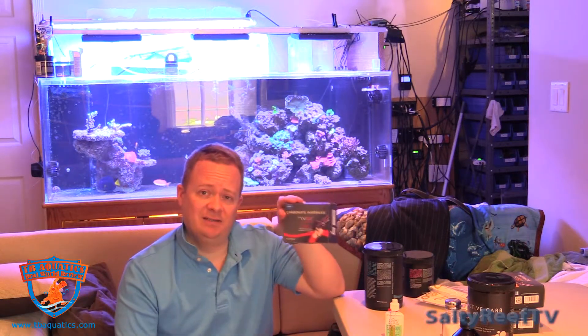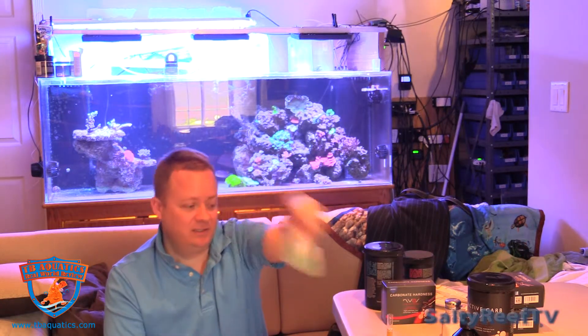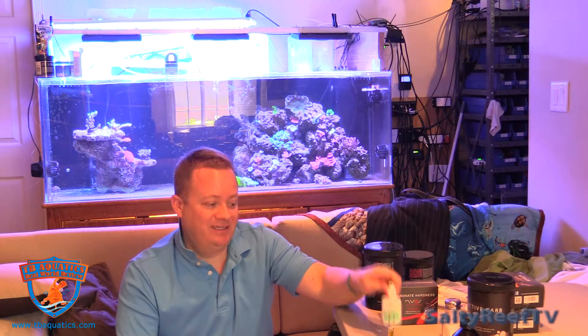It's kind of a split down the middle. I like the fact that the NEOS has a syringe and that the vial is plastic. I can't tell you how many test kits I've bought just because I accidentally dropped the API vial, which is glass. I basically have three or four bottles of reagents laying around, but I keep buying the kits because I break the glass tube. So that's a point for the NEOS. But all in all, when it comes to actually doing the test, the API test kit is easier to use. So it's kind of a split down the middle.